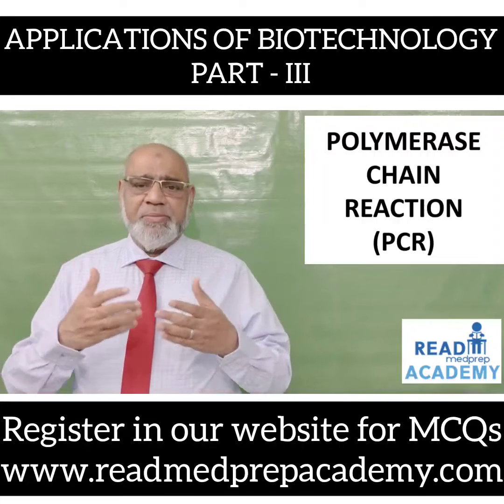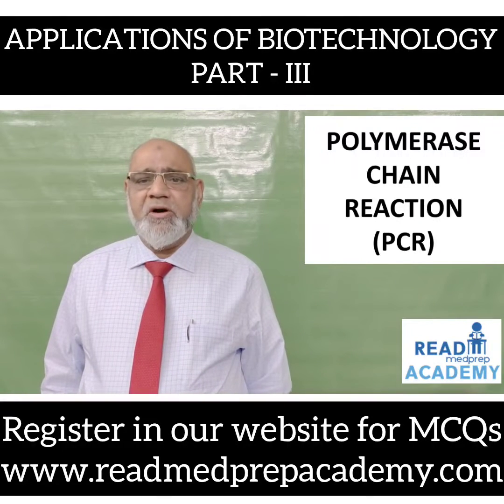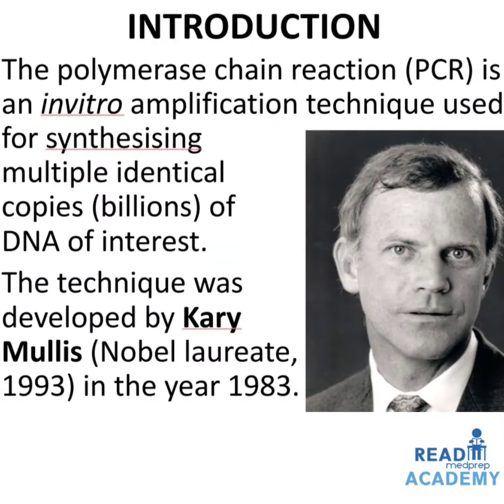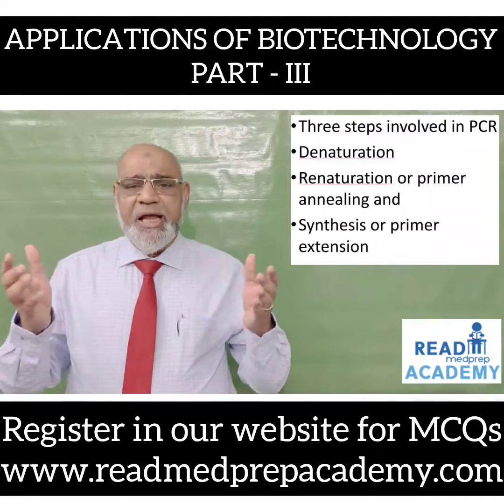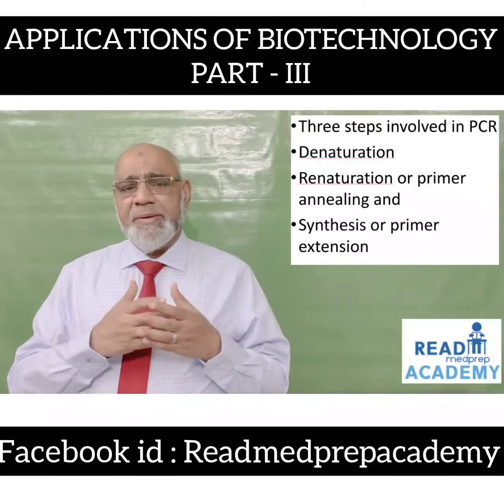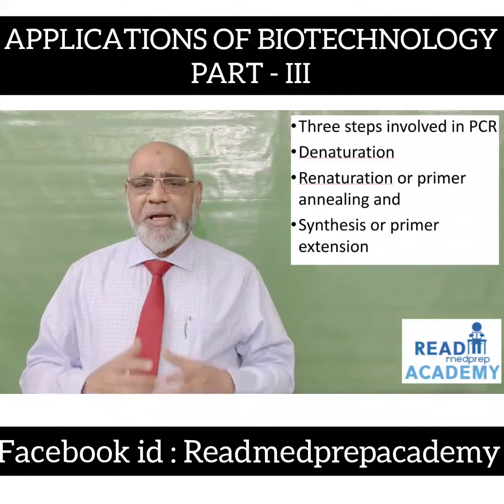Now let us move on to the polymerase chain reaction, shortly called PCR. The polymerase chain reaction PCR is an in vitro amplification technique used for synthesizing multiple identical copies, in billions, of DNA of interest. The technique was developed by Kary Mullis in the year 1983 and he became a Nobel laureate in 1993. Three steps involved in PCR: denaturation, renaturation or primer annealing, and synthesis or primer extension.